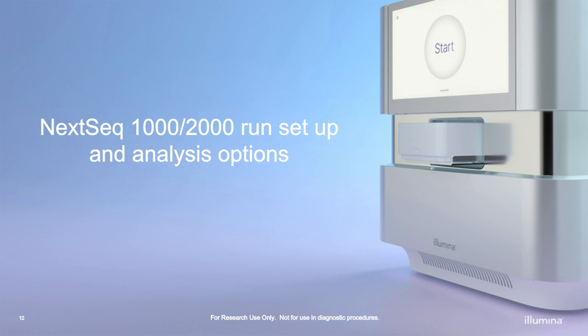Okay, so now that we know the file types that DRAGEN produces, let's talk about the run setup options for the NextSeq 2000.